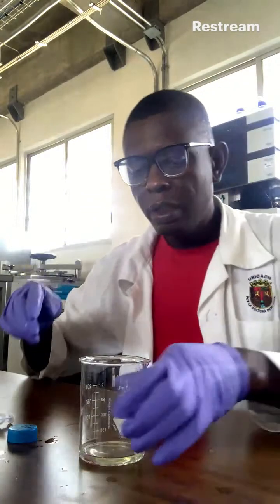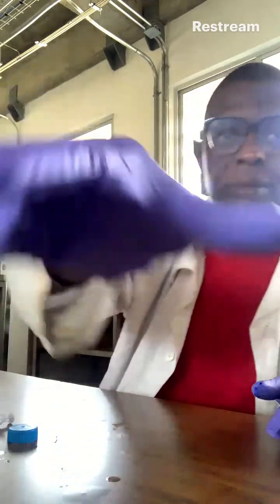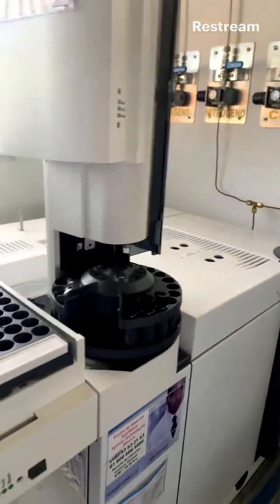Now, the next step is to go to the GC machine. So I will take you guys to the GC machine. So this is where I will be running the sample in the GC machine.